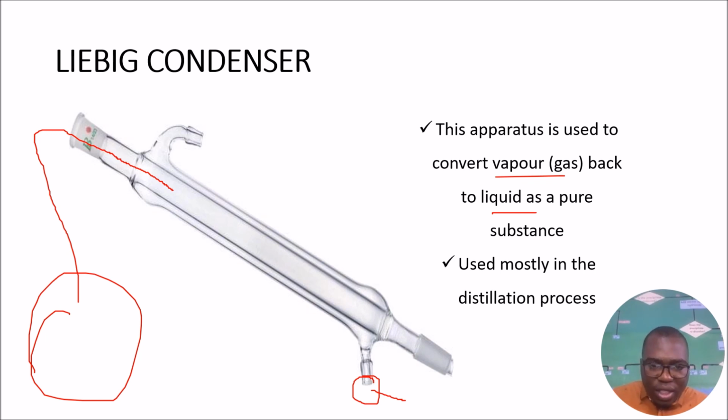It's like the way the pen is. There is a pipe inside this whole thing, a pipe which goes all through like that, and the water passes outside this pipe.